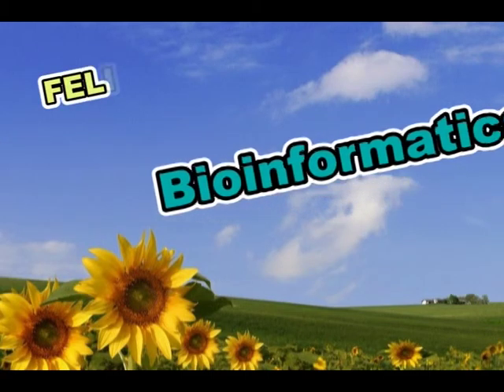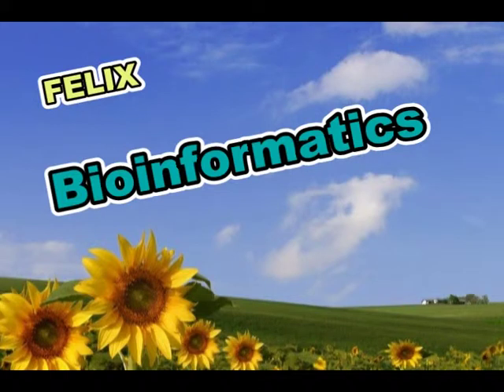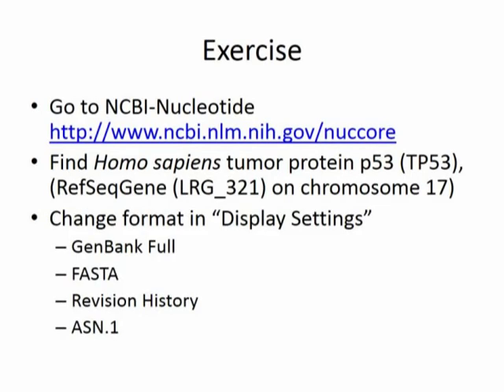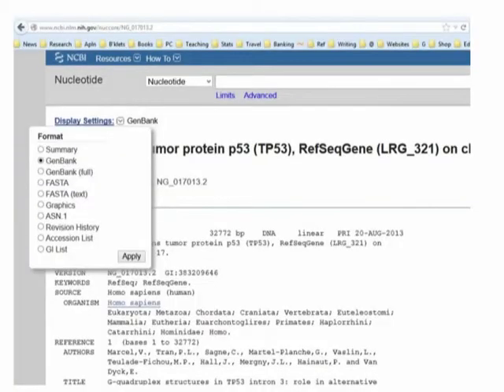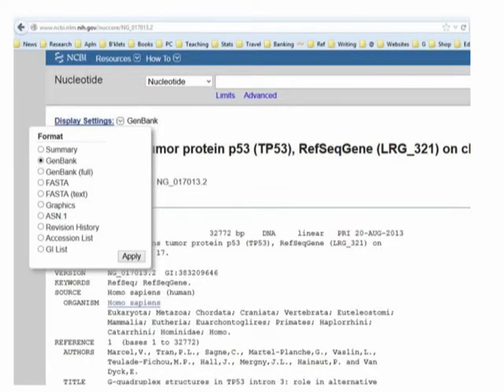We were discussing biological sequence databases - specifically the protein and DNA databases. In the last class we covered an overview of what a database is and an introduction to the DNA database. The exercise was to find TP53 in NCBI - the nucleotide core database. TP53 is the gene coding for the tumor suppressor protein P53, and the reference entry of this gene is in the RefSeq database, not the normal GenBank database, since it has already been curated and finalized.